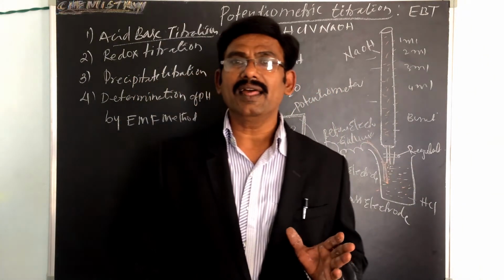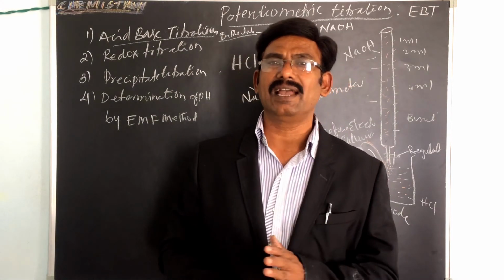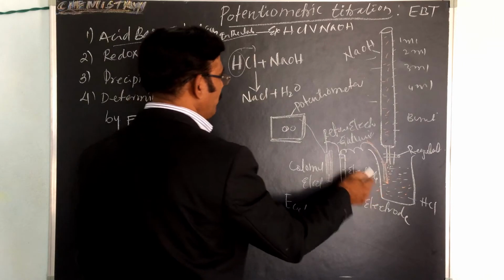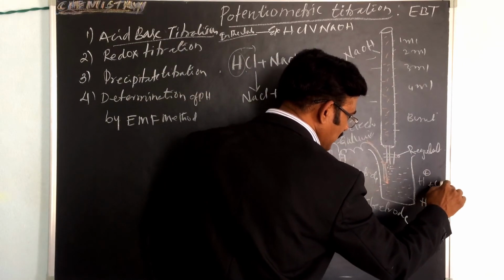So what happened here? The EMF goes on decreasing as H+ ion concentration decreases. In the acid, H+ and Cl- are there.